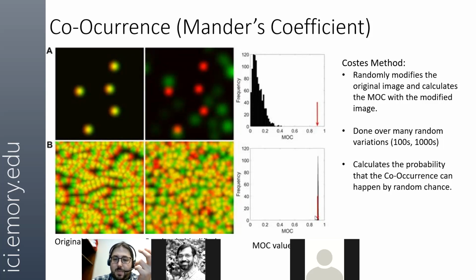It's also indicated by that red arrow, but because of the way the data looks, it is a calculation that could occur randomly pretty often. So it's not a coefficient for example B specifically that we can reliably say did not occur by chance. Now, does that statement make sense to people?